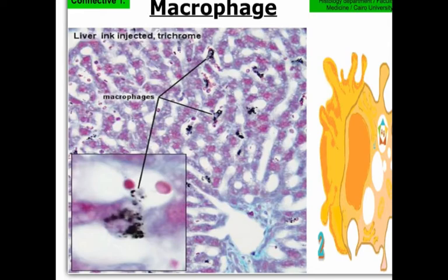As you see, we have here phagocytosed particles of the stain inside this histiocyte. This histiocyte originates from the blood monocytes, and its site is in the connective tissue, mainly around or over the collagen fibers and near the blood vessels. As regards the LM, they are large and branched cells, not small. Very important, they have many folds representing the pseudopodia of these cells. Also, the cytoplasm is highly granular due to the phagocytosed particles, and it has a large kidney-shaped nucleus similar to that of the monocyte, and it can be demonstrated, as we have said, by vital stains.